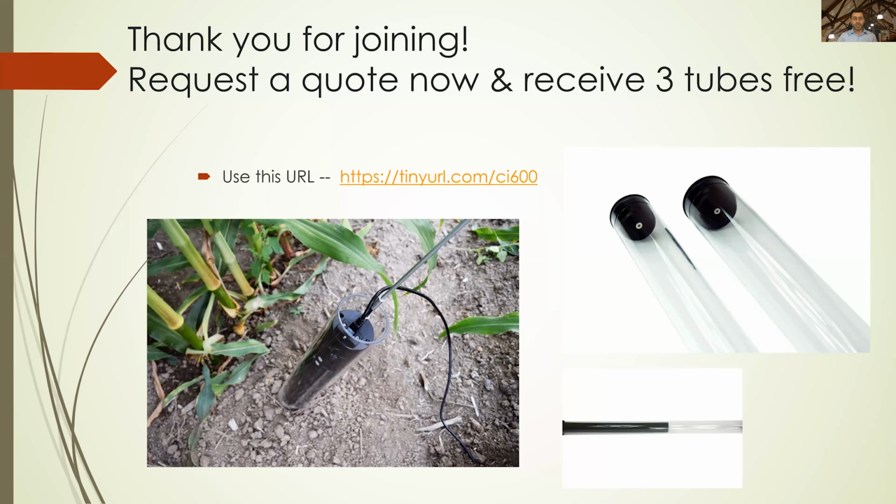Can you use RootSnap for root images obtained by other scanning devices? The answer is yes. Actually, you can import really any image into RootSnap. If you import an image that's not roots, of course, it might have some issues simply because it's trying to delineate between root and soil a lot by color contrast, light contrast, and brightness. So if you're trying to put your picture in it, it's going to come out a little funky, but you'll be able to use it for other pictures.